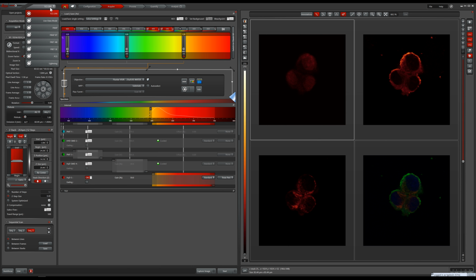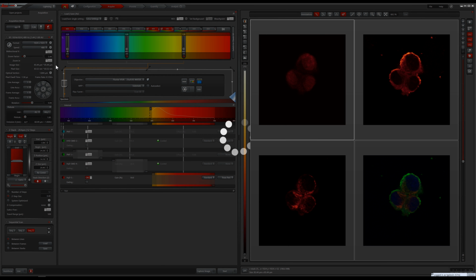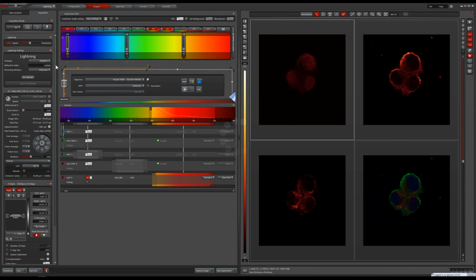Finally, we want you to be aware of Leica's automatic deconvolution tool, they call Lightning. Most settings are identical to the confocal settings under TCS SP8, but you also get the Lightning slider and the Lightning settings. When the slider is activated, you will notice that some of your XY settings become unmodifiable. And when dragging the slider either towards speed or resolution, these XY settings will change. Since you want to be in control of your experiment, you don't use this automatic tool but rather adjust your settings as needed for XY.